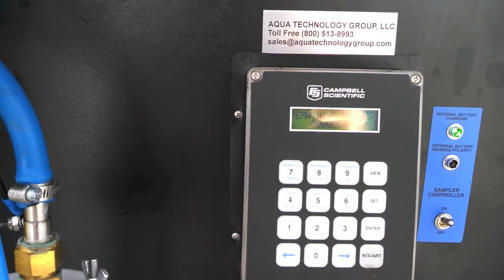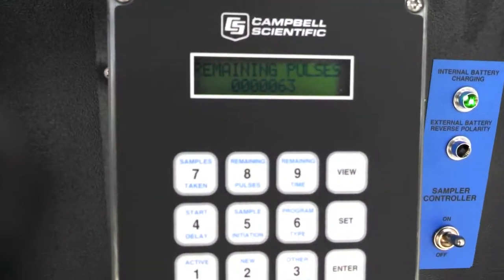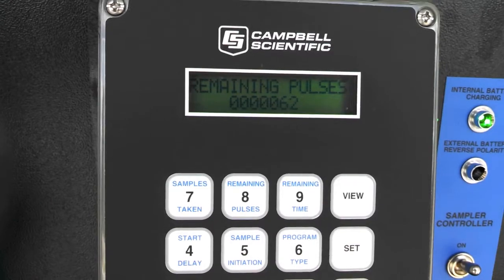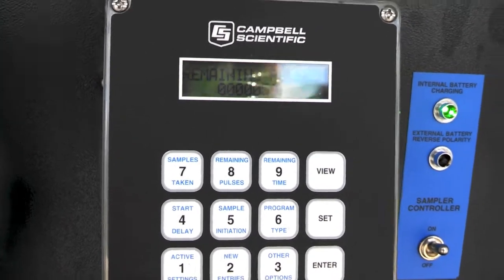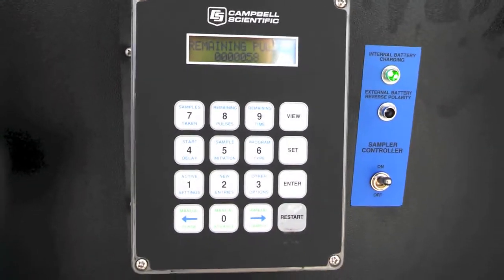I'm going to go back and review the remaining pulses — you can see that counting down: 62 pulses, 60 left. That's based upon the flow we have here right now, about 1,100 gallons per minute.